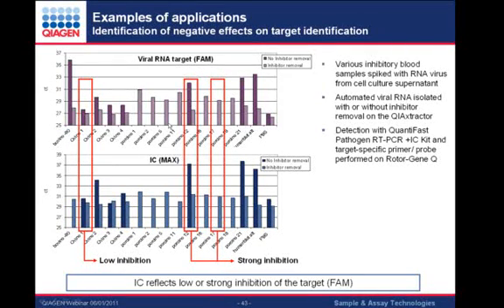And these different degrees of inhibition for the other samples for the viral RNA detection are perfectly reflected by the results for the internal control, as you can see in the lower figure here with the blue bars. For this exemplary ovine sample, the CT shift for the internal control is also very low and identical to the target CT shift for the viral RNA. And for the two porcine samples, there's also a strong shift for the first one, corresponding to the viral signal, and there's also complete dropout for the second sample, corresponding to the viral RNA result.